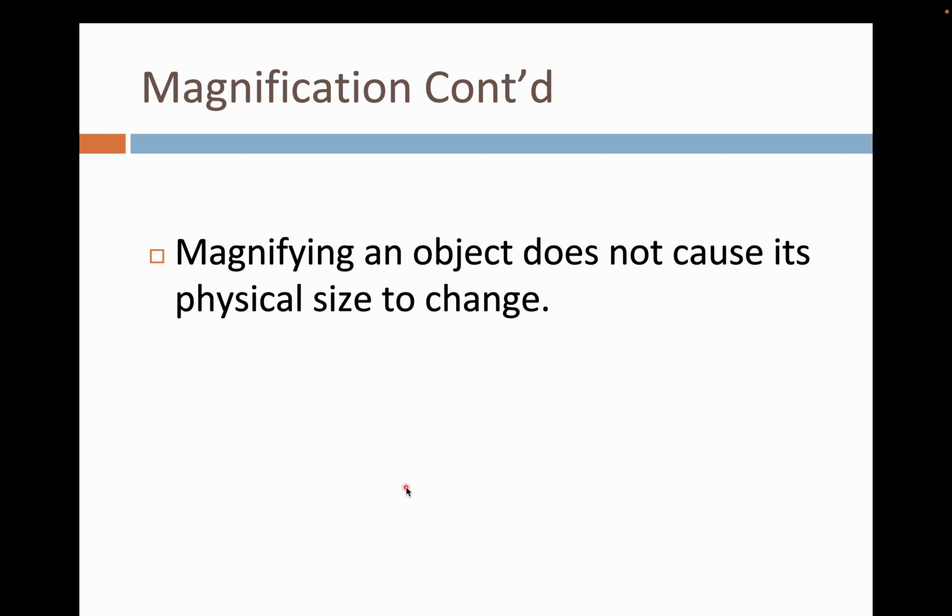Magnifying them from the smaller level of magnification to the highest level possible, given the limitation of the bright field microscope that you have, even though you do that, increasing magnification, you don't change the physical size of your specimen. The physical size does not change.